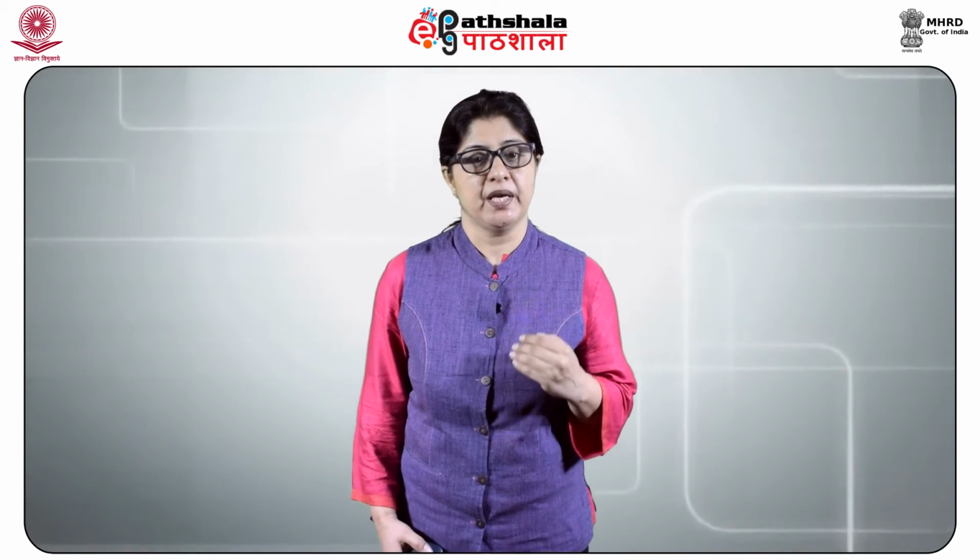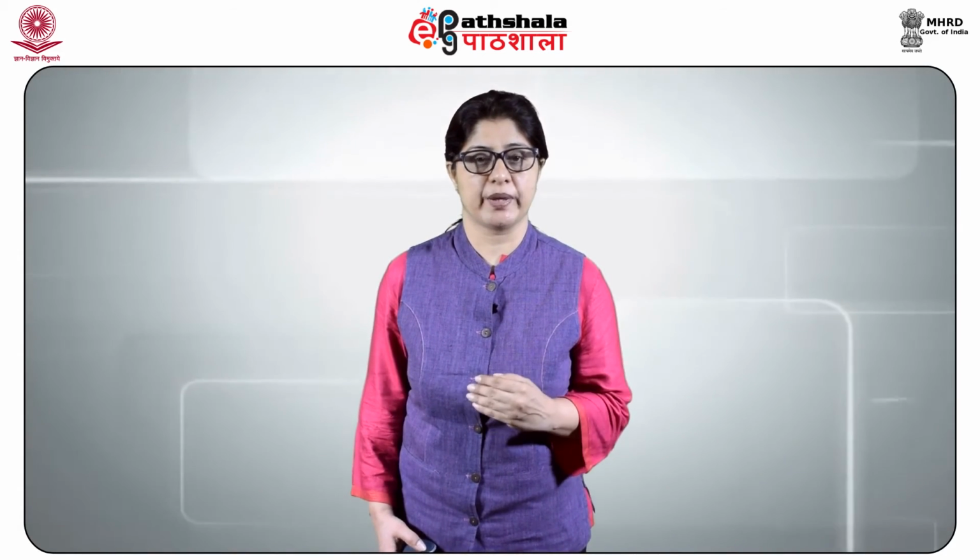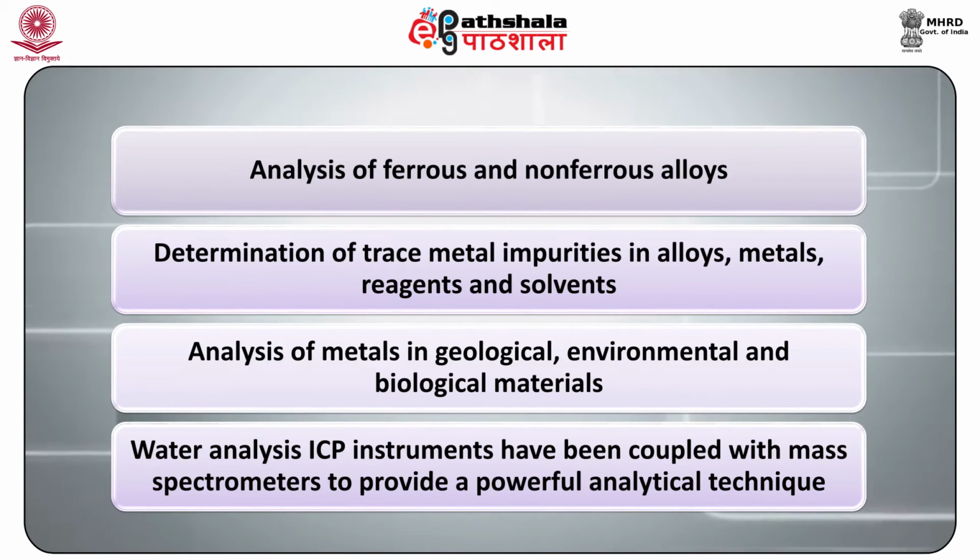Applications of atomic emission spectrometer. AES can be used in the following: analysis of ferrous and non-ferrous alloys, determination of trace metal impurities in alloys, metals, reagents and solvents, analysis of metals in geological, environmental and biological materials, and water analysis. ICP instruments have been coupled with mass spectrometers to provide a powerful analytical technique.